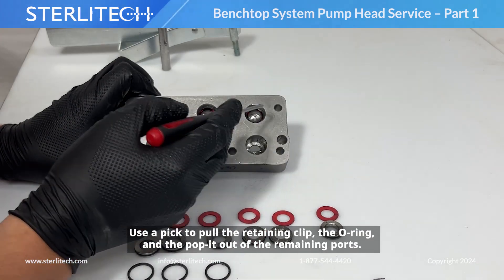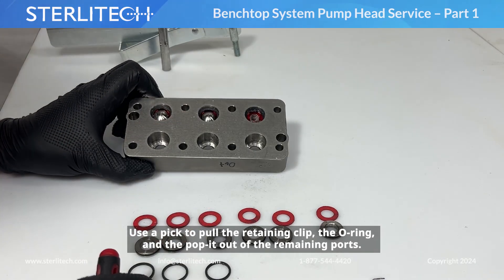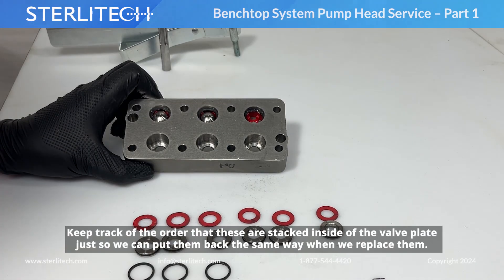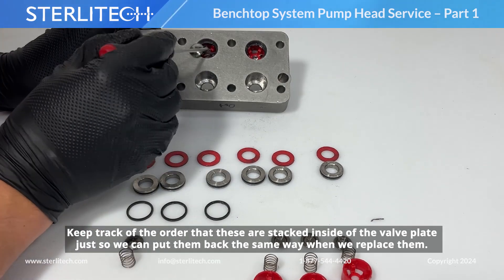Now I'm going to use my pick to pull the retaining clip, the O-ring, and the poppet out of the remaining ports. I'm keeping track of the order that these are stacked inside of my valve plate, so I can put them back the same way when I replace them.